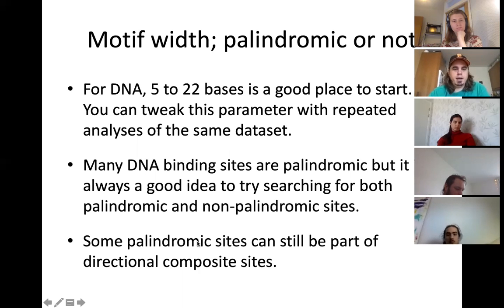to see. And in some cases, this is something that's happened to me, you will have a palindromic site, but then you will have a site right next to it that's non-palindromic. So this is kind of tricky, because if you do the palindromic search, you will pick this up. But then if you do the non-palindromic, you will start to see that on one side of the palindrome, there will be something else that's non-palindromic. And that's why it's worth doing both.